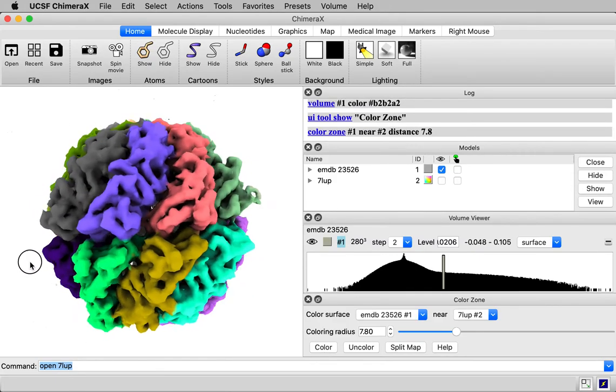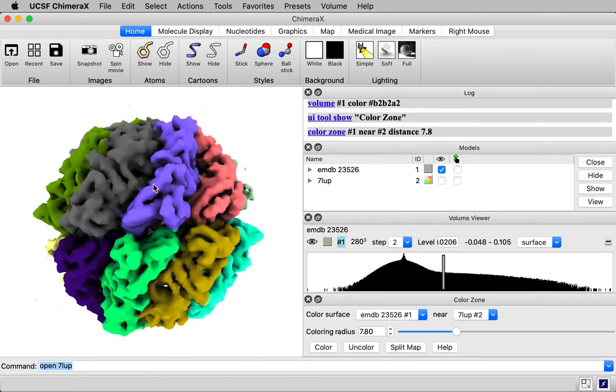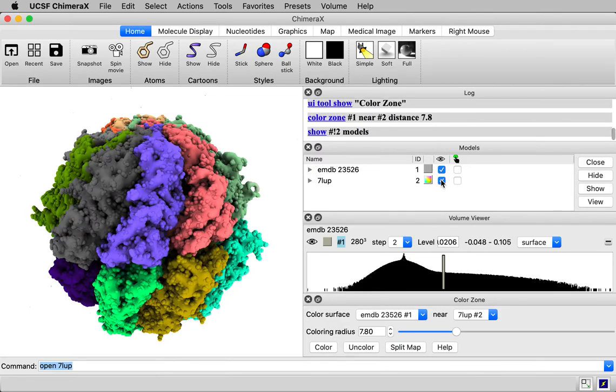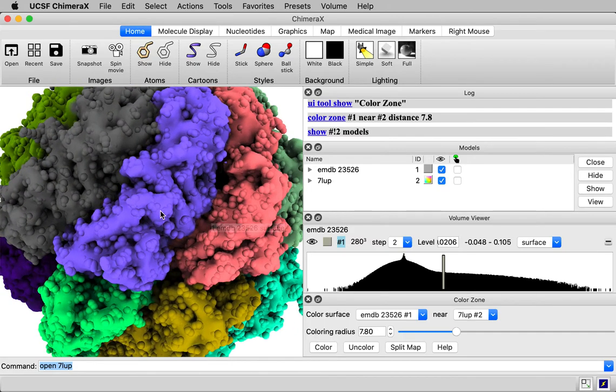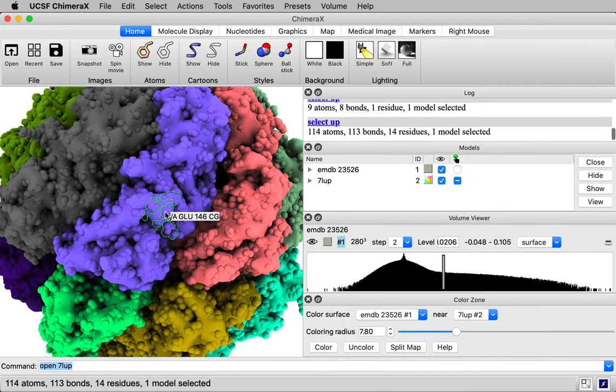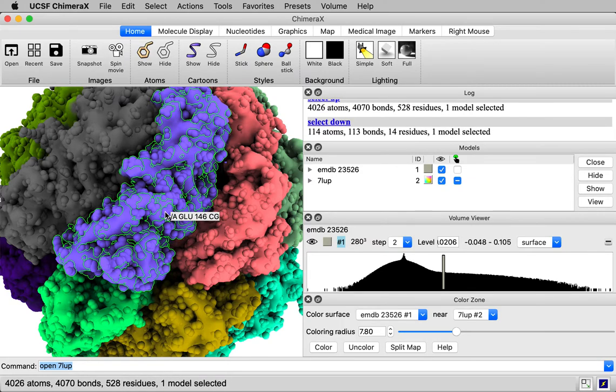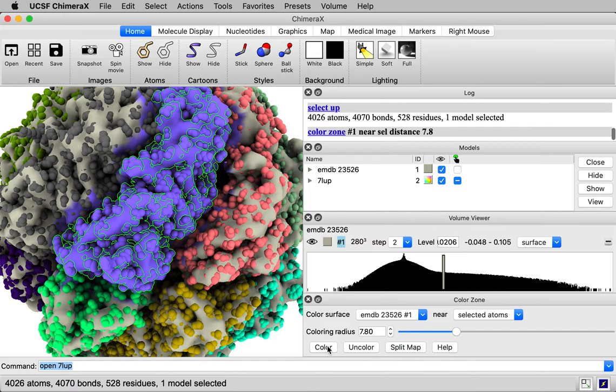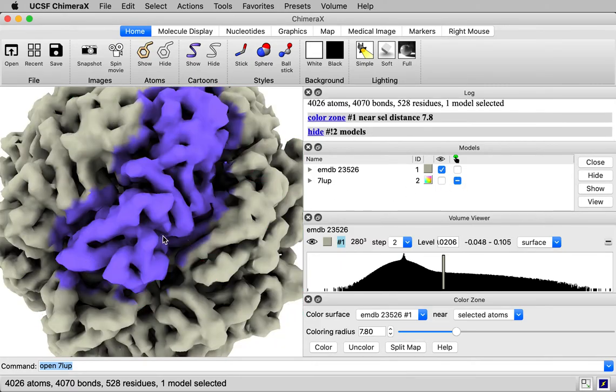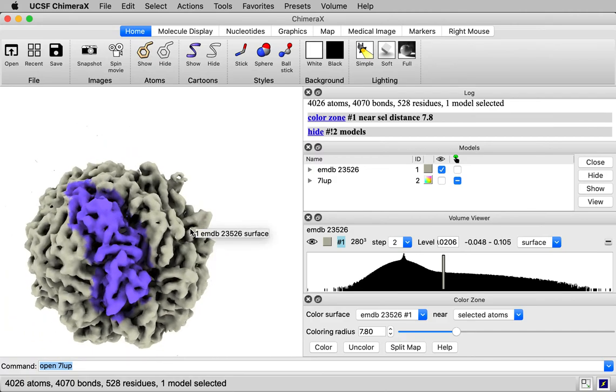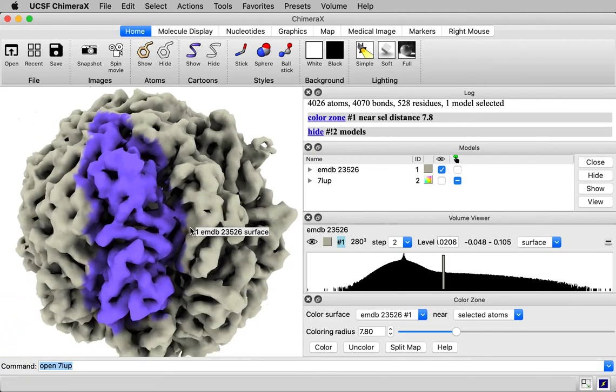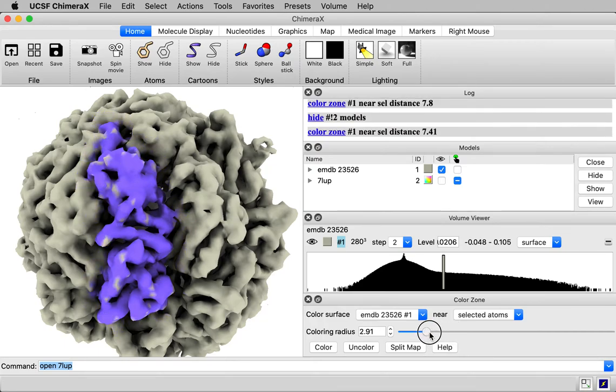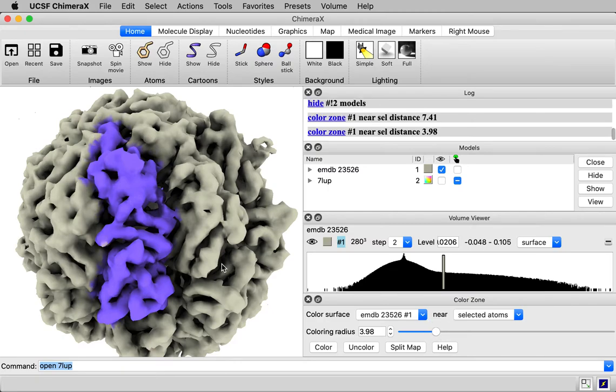Suppose I wanted to color just one chain, say this purple chain, which is chain A. Let me show the atomic model. I'll select an atom, one of these purple atoms, by control click. And then press the up arrow key a few times to select the whole chain. And then in the color zone panel, I'll say color near the selected atoms. And I press the color button. And if I hide the atomic model here, you see our map just chain A is colored. You see the color spills over to the neighboring proteins. That's because of this distance, this coloring radius. And so I can make a smaller coloring radius so that it doesn't spill over.